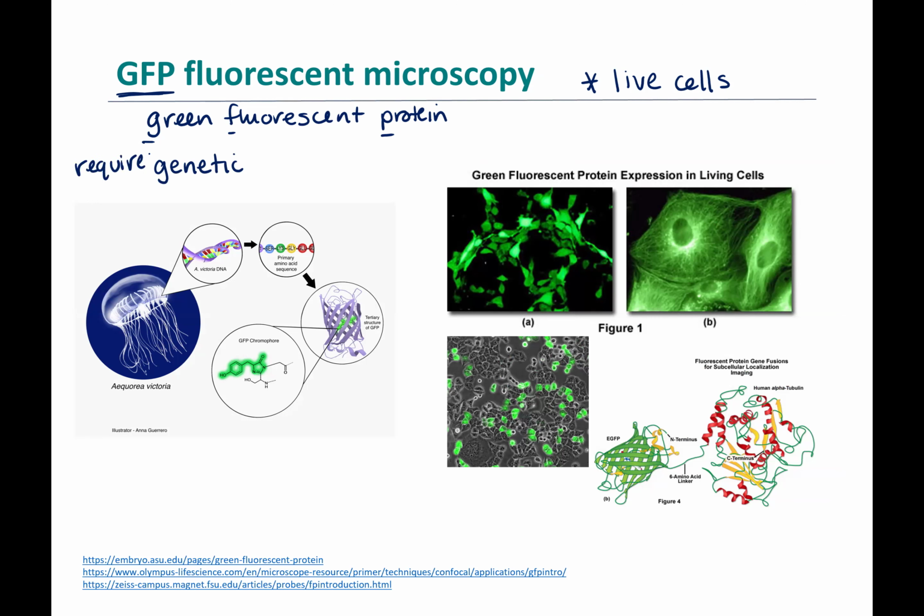It requires genetic manipulation of the cell. And what I mean is we make something called a GFP fusion protein.